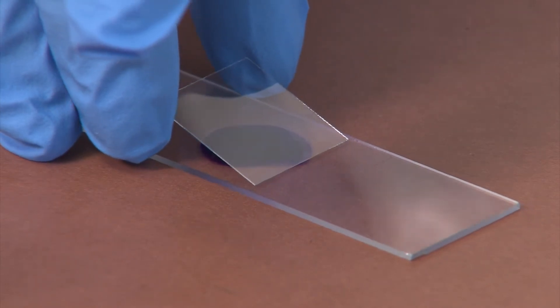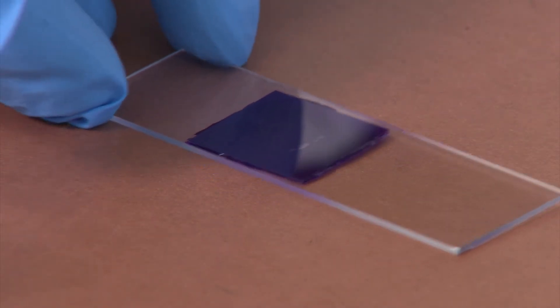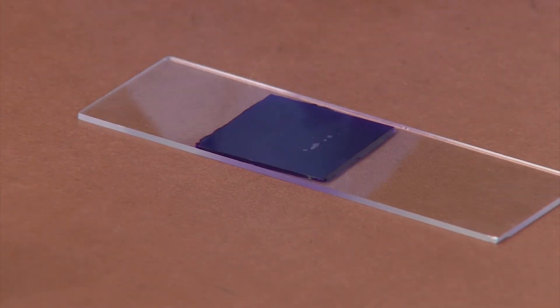Slowly lower the outer edge of the cover slip onto the sample. Be careful not to drop the cover slip or press down on it, as this could break the cover slip. If you need to, use a dissection needle to lower the cover slip edge.